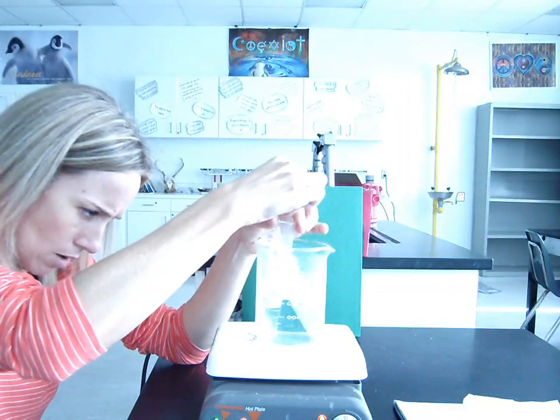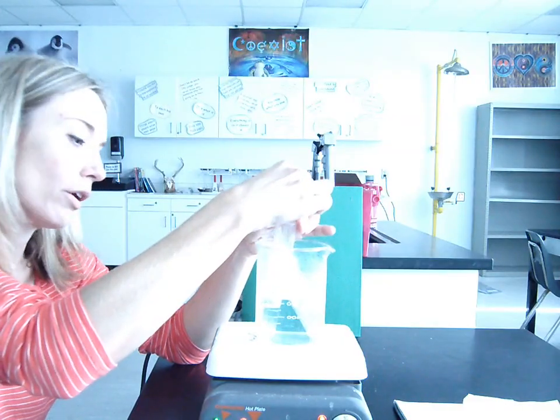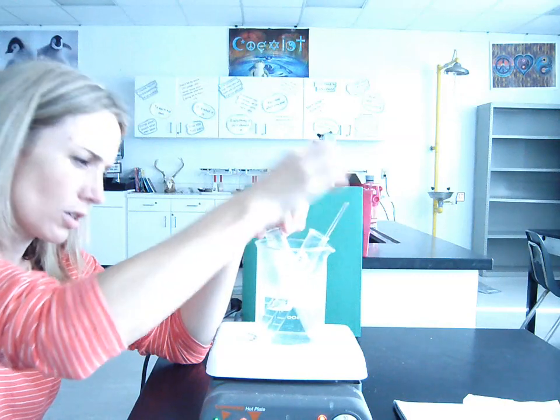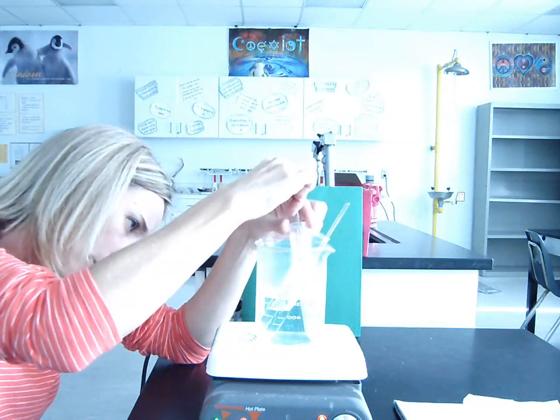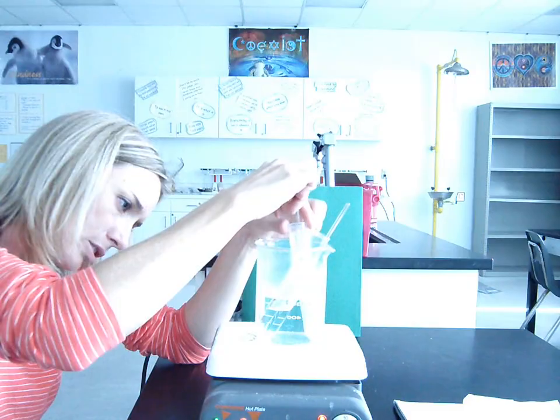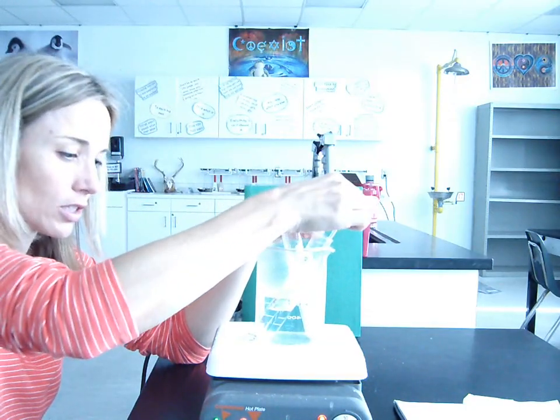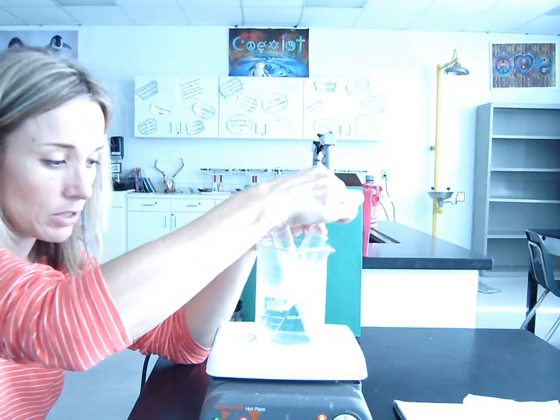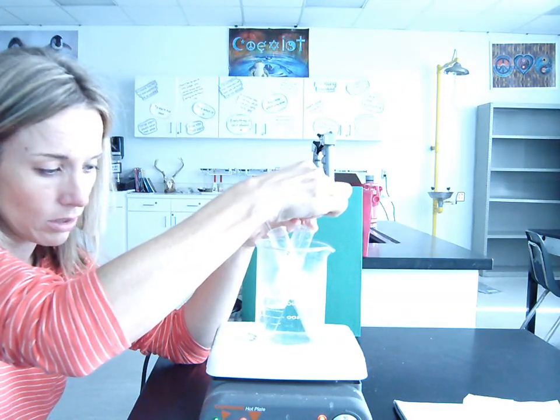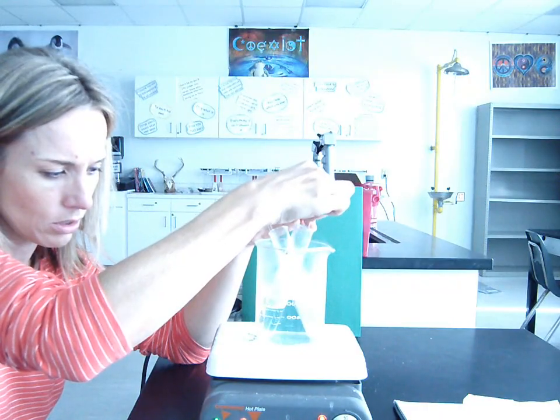So far, substance B actually does look like it's dissolving a little bit now that it's getting warmer. It's definitely much more dissolved than it was at room temperature. Substance A, it's really hard to tell if any of it's dissolving. There's still a lot of substance left undissolved. Substance B, I'm going to show you in just a second, is actually dissolving entirely. All of substance B is now dissolved.